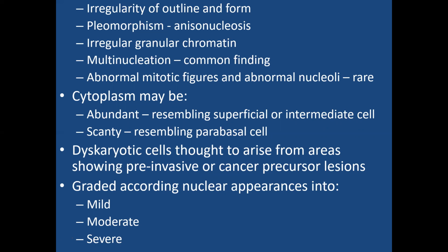Because you see, in cytology, the brush goes to scrape the top of what? The epithelium, and it's smeared on the glass. So what you will see on the slide is abnormal cells. You're not going to see the abnormal epithelium. You're not going to see the whole of the epithelium. You're only seeing single cells that have been scraped or removed from the abnormal epithelium.